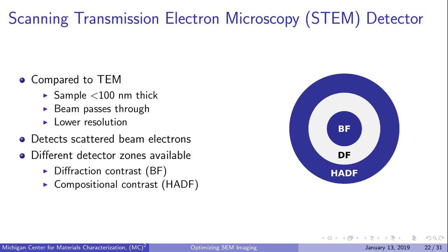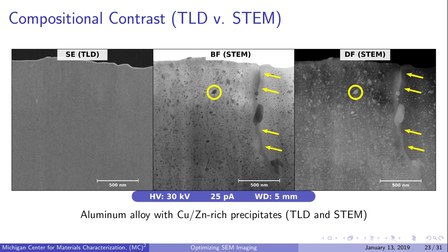Now let's look at some images created with the TLD and STEM detector. This series shows an aluminum alloy imaged using the TLD and two STEM modes: bright field and dark field. With the TLD, we're detecting secondary electrons from the surface, which appears relatively smooth and featureless. In bright field STEM mode, we're looking through the sample and can see much more information, including a grain boundary running vertically that was almost invisible using the TLD. We can also see copper and zinc rich precipitates throughout the sample. Because these precipitates are heavier than the aluminum matrix, they scatter to higher angles, appearing dark in bright field and bright in dark field mode. The same features are visible in both modes, but the colors are inverted.